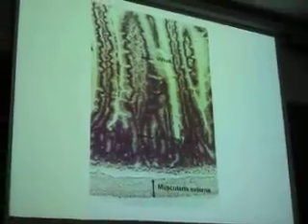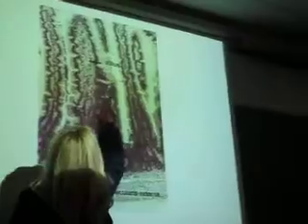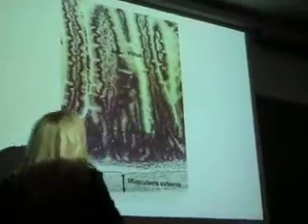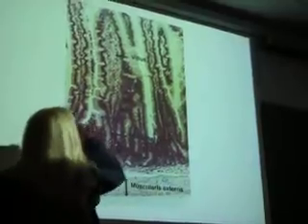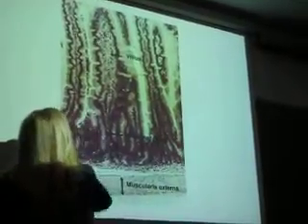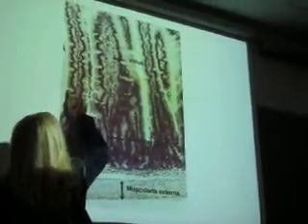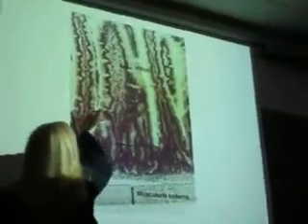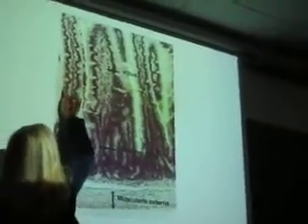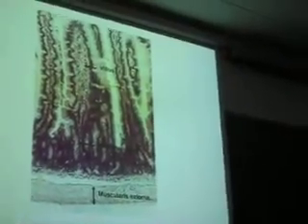All right, so each one of these structures up here is a villus. Villus, villus, villus, villus, villus. Plural, they're called villi. So what you're seeing in a villus are folds of the mucosa, and if we run our finger up in this direction, we're following that epithelial tissue layer. Okay, so the walls or the sides of the villus are going to be made up of these simple columnar epithelial cells that have microvilli on their surface.